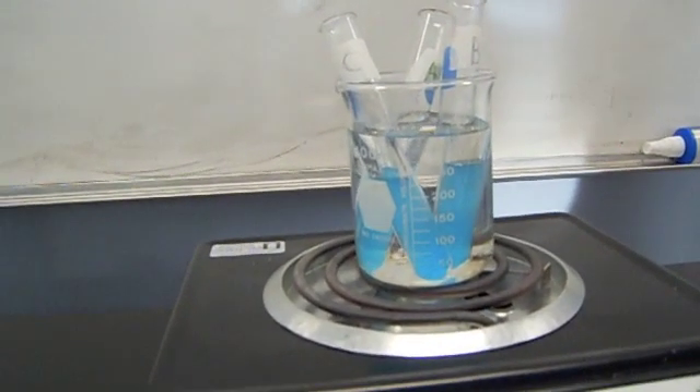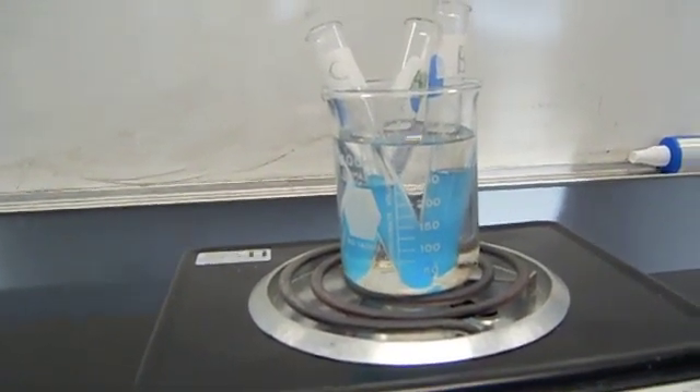Test tube A, containing starch and saliva treated with vinegar, had a negative reaction because the pH level denatured the enzyme and could not process the starch. Test tube B, containing starch, saliva, and water treated in a boiling water bath, had a weak positive reaction because the temperature slightly changed the enzyme and it is not as effective as it would have been at normal temperatures. In this experiment we saw how enzymes worked in normal conditions, but we would like to see how enzymes would react in space with more complex conditions.